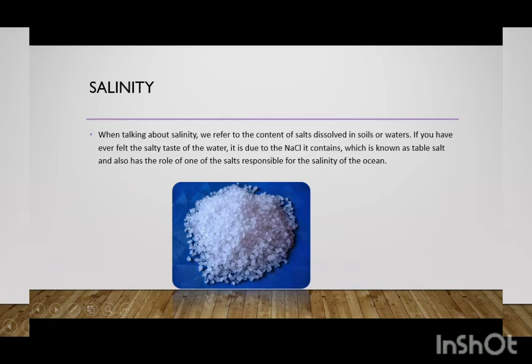In life, water plays a very important role in various biological processes. Almost 71% of the planet is covered by water. Even our body is made of more than 50% of it. This practice indirectly dabbles in the ability of water to dissolve a substance. For example, by mixing water with sugar or salt, it gives the impression that they tend to disappear when dissolved, but by evaporating the water with dissolved substance, we can recover them.